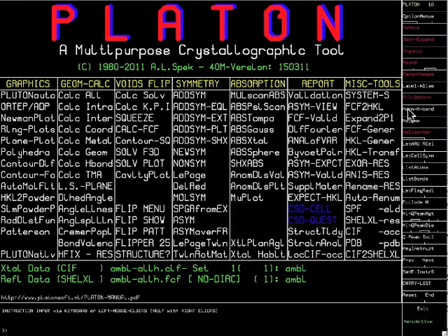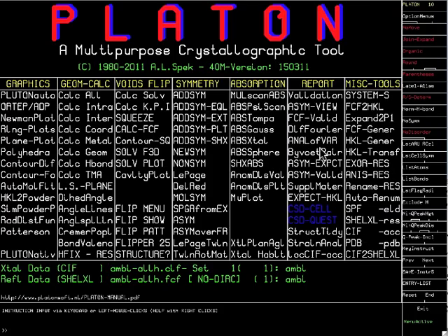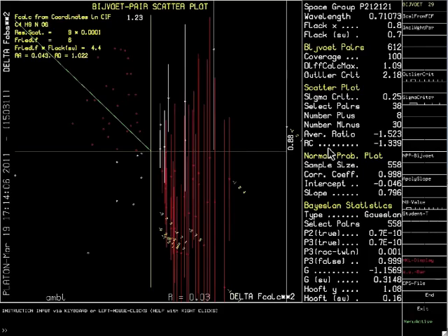In the main menu of Platon, we click on the Bijvoet pair analysis. The screen now shows the result of several different analyses of the absolute structure.